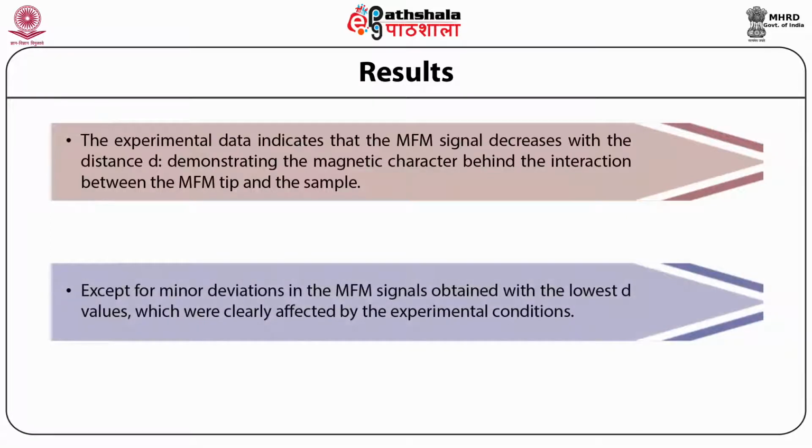Except for minor deviations in the magnetic force microscopy, the MFM signals obtained with the lowest D values were clearly affected by the experimental conditions.